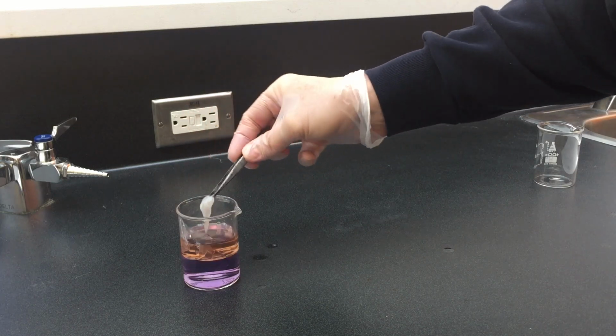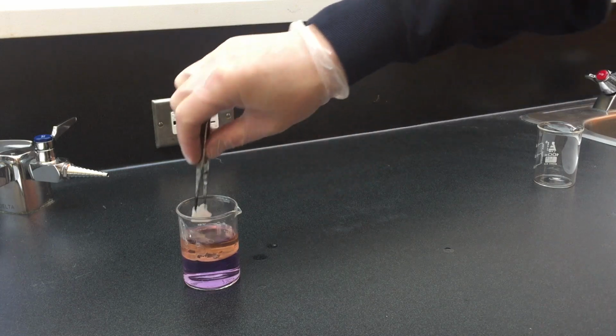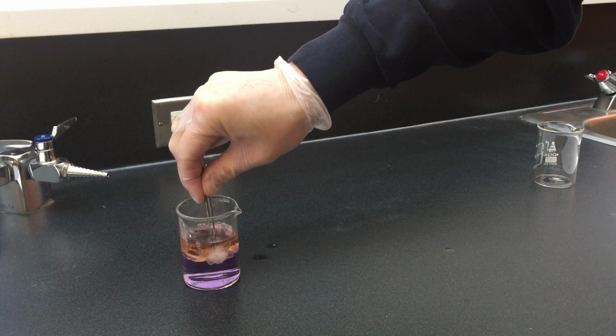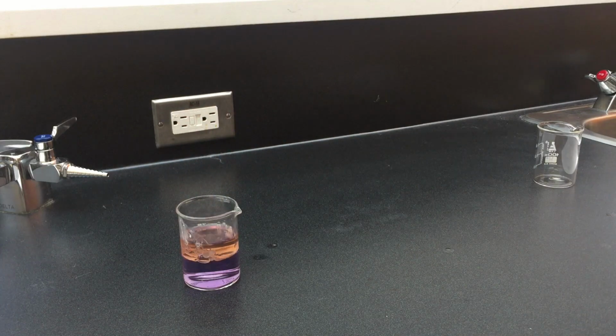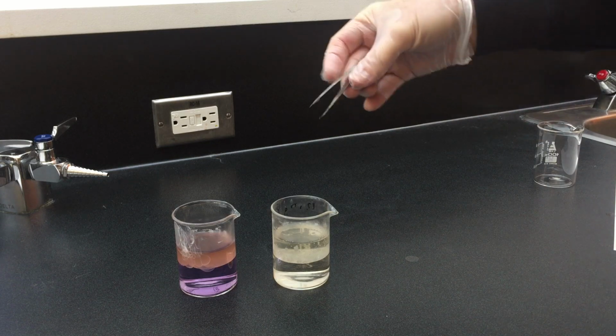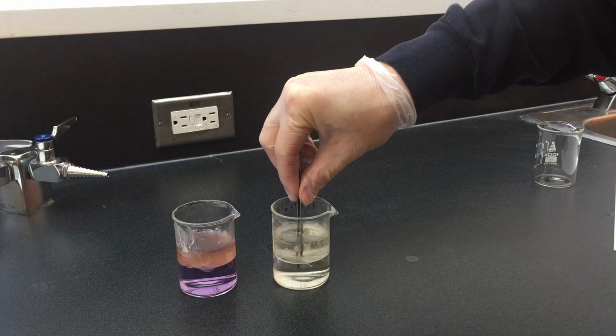From the very little amine and acid that we put in, we can get quite a bit of nylon coming out. Okay, with one that I set up earlier without any dyes in it, so you can't see which is the acidic or basic one, let's see how the fiber works this time.